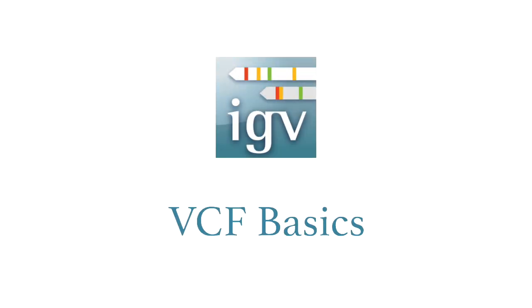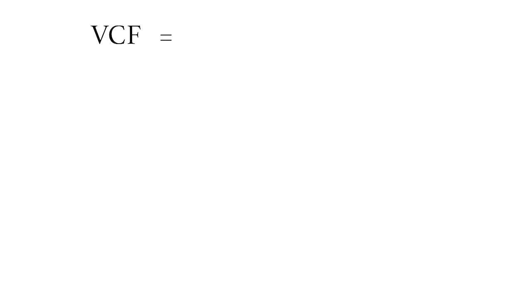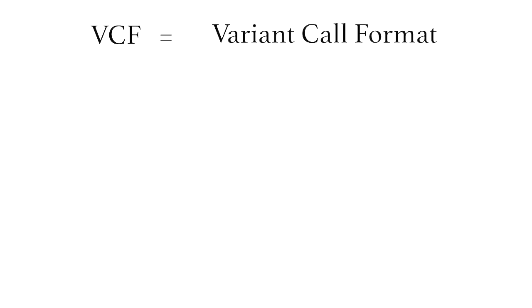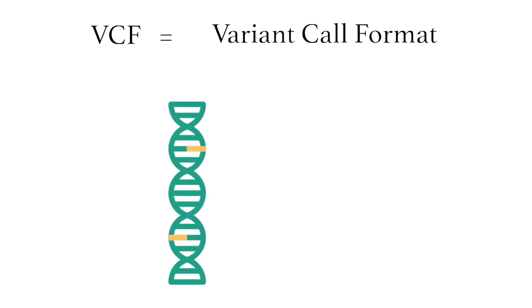Here I'll show the basics of viewing VCF files in IGV. Before we look at a VCF in IGV, let's review what a VCF file is. VCF stands for Variant Call Format, and as opposed to a FASTA or BAM file which store long genomic sequences, VCF files store variants only.